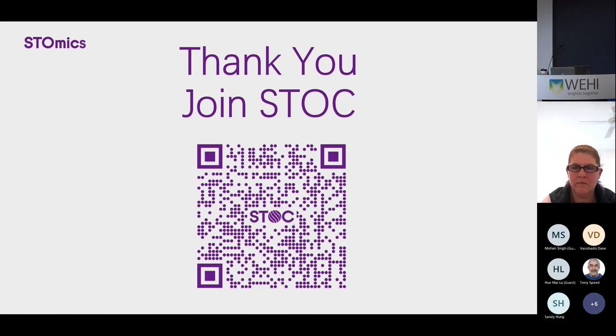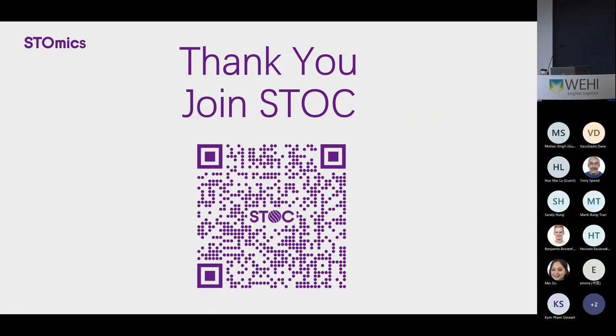Yeah, there's no reason why we can't. That's certainly something that we need to work on. As you can see, a lot of the work we've done with Stereo-seq so far has been in a variety of different fields in academic research. But especially as we start getting more into the translational and clinical stuff, applications like these are the ones that we're really prioritizing, the genome and also everything to do with better understanding immunology.